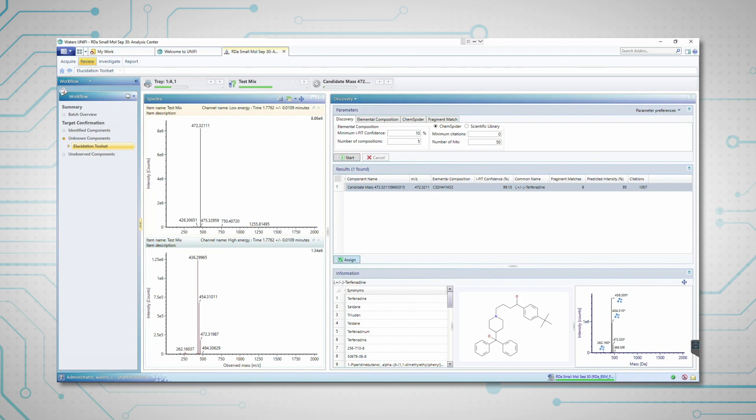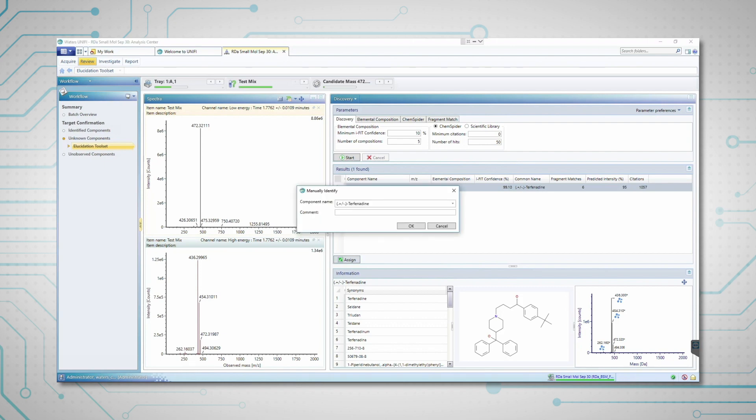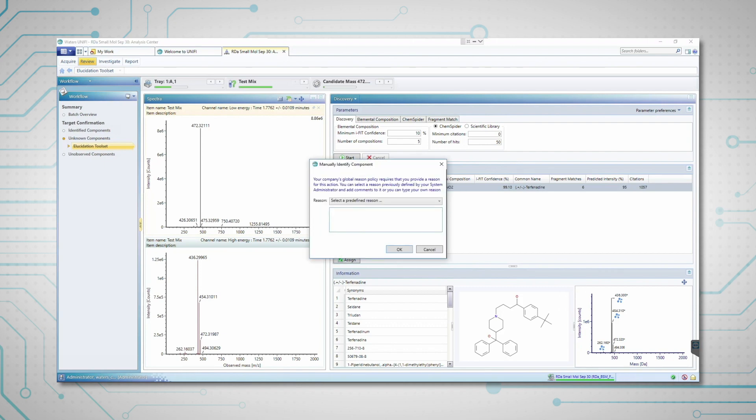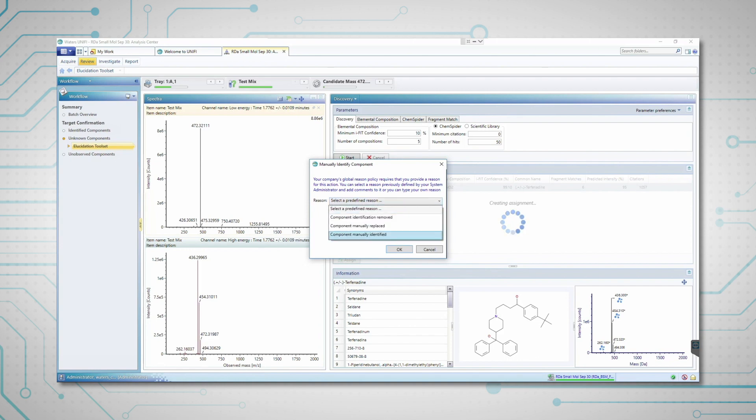An example is shown here for tephenidine. Once confident with the proposed identification, the component can be assigned.